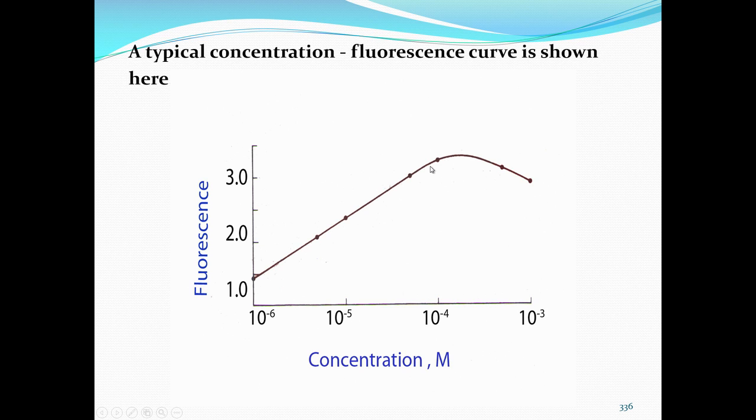But still this itself is a great advance for the detection of materials, especially fluorescing materials, because the application of this principle would permit you to work at higher ranges and different ranges also.